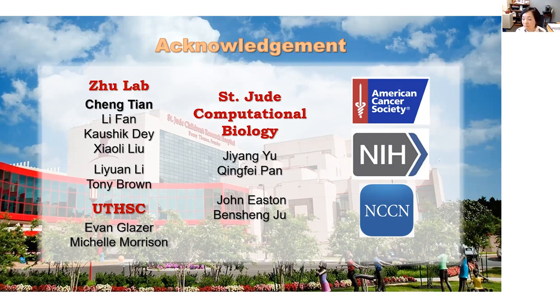How long can the spheroid models be maintained in culture to monitor tumor-liver interaction? So for the first, the 3D spherical culture condition, the suspension culture condition, we found that tumor cells have no problem, tumor spheroids, but the liver spheroids, especially hepatocytes, they gradually de-differentiate. After 7 to 10 days, we would notice that those hepatocytes, even without tumors attacking, don't look like hepatocytes that much anymore. So that's why we gradually moved on to what we call the 2.5D culture condition.